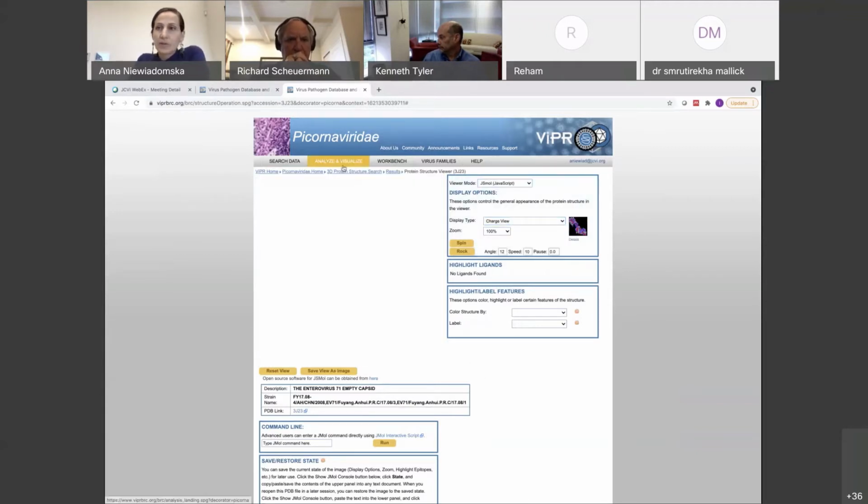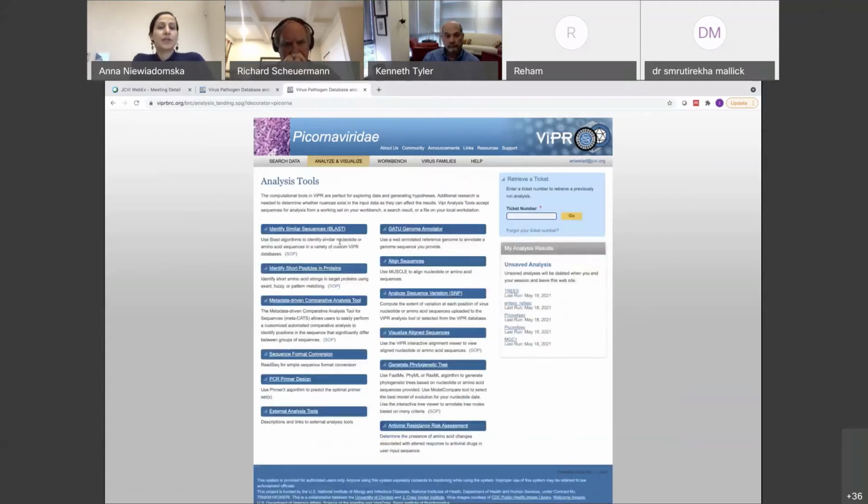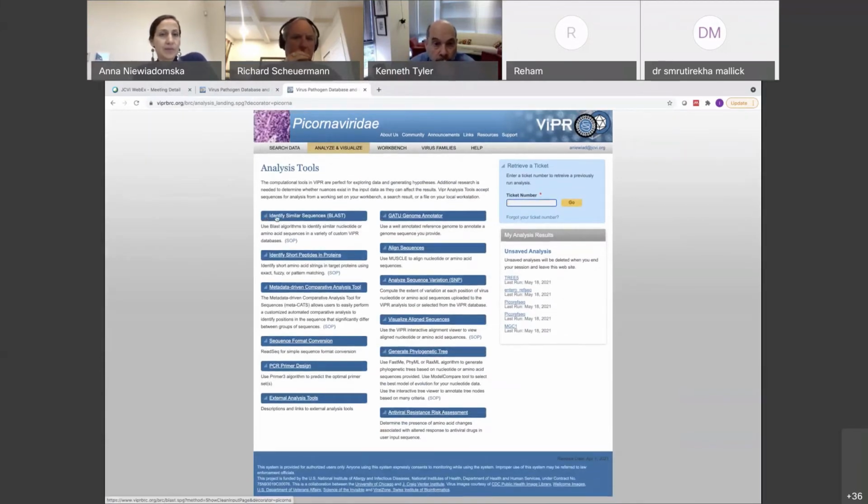Okay, so we're getting close to 9, so I'll just run you quickly through the different tools that we have available before we move on to questions and our guest lecture. We have some traditional bioinformatic tools that you're probably already familiar with, such as BLAST. You can also look for primers and design your primers using the tools here. You can perform multiple sequence alignments, look for sequence variation. You can generate phylogenetic trees.